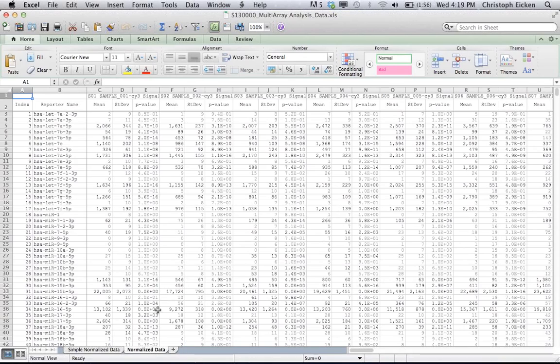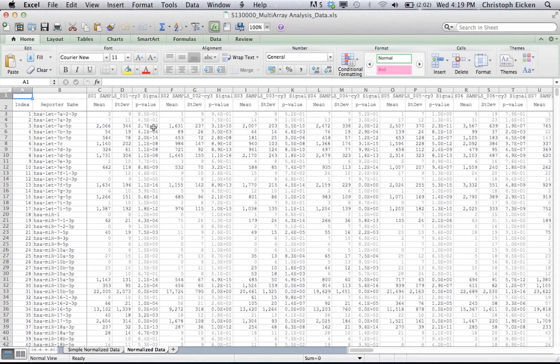On the normalized data page, you basically have the same information just in a little bit more detail. Besides the mean value, you have also the standard deviation as well as the p-value for the probe repeats.